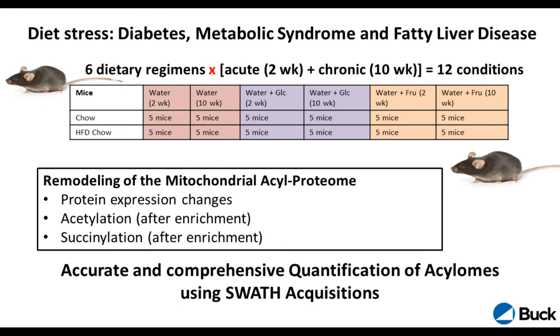So we had 6 dietary regimens: fructose, glucose, high fat, and then combinations thereof. And then 5 replicates for each of the conditions. So we had overall 60 samples, and so that was quite a large experiment here. So we would process everything with SWATH, and that was also quite nice because we would be comprehensive in the mass spec nature.